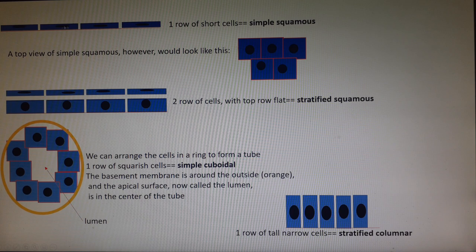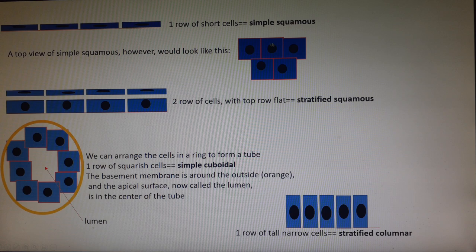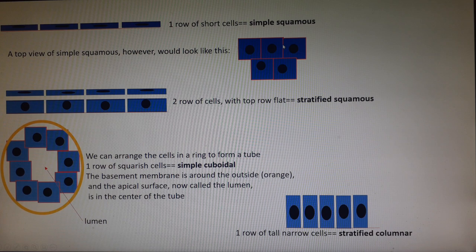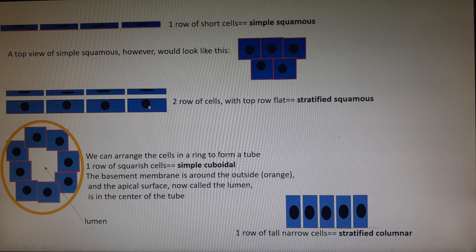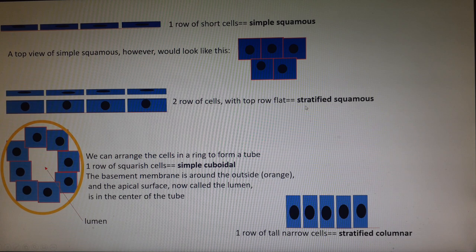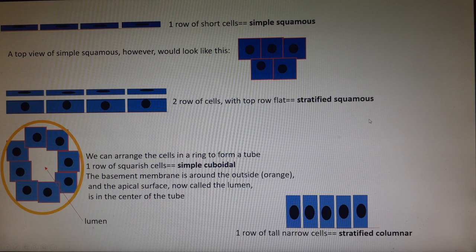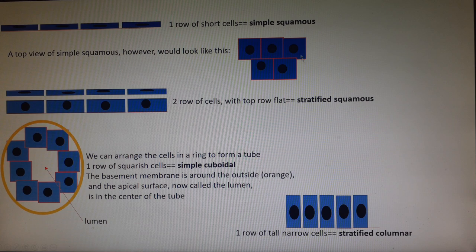If you look at simple squamous tissue from the edge the cells look flat and short, but if you look at it from above it actually looks like a tile floor. The nuclei look round from the top view, and the basement membrane would be behind the screen. If I have a basement membrane with all different kinds of shaped cells but at the very top I have a row of flat cells, then this tissue would be called stratified squamous — more than one row, with the top row flat.